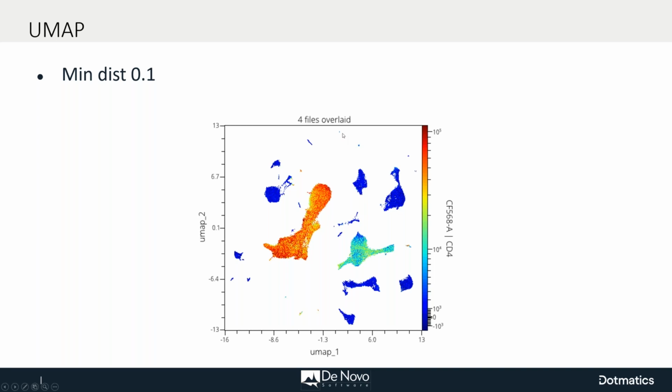So it will certainly just end up in its own island. But if I then had to cluster this data, if I put in 10 or 15 clusters, it's very unlikely that this event or those few events right here would end up in their own cluster because they're just so rare. They'd get lumped in maybe with their nearest neighbor. And that's a little bit of what Andrea was talking about with the density dependent downsampling or the target downsampling. It helps clustering algorithms deal with that a little bit better.